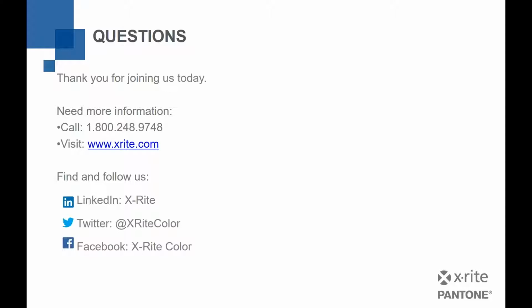So one question I will answer that I see, asking about non-contact measurement. We do have the ability. The instrument I talked about today was the 7800. We do have another instrument. It's called a VS3200 MetaView instrument, which does non-contact measurement.